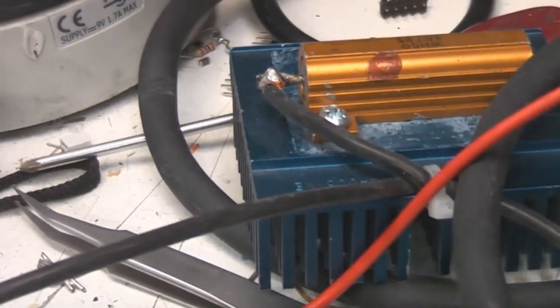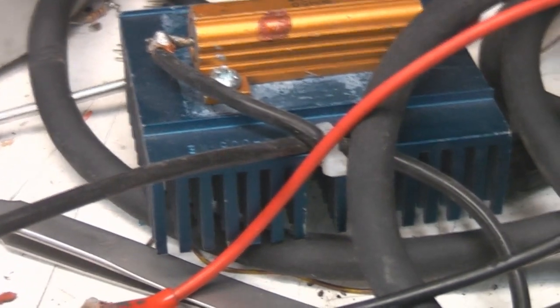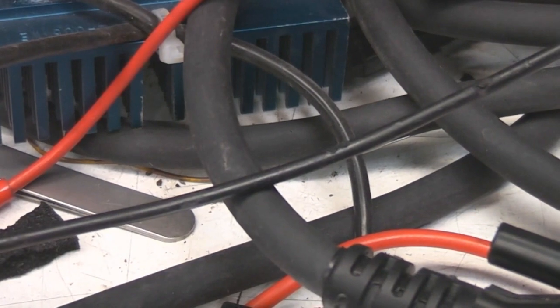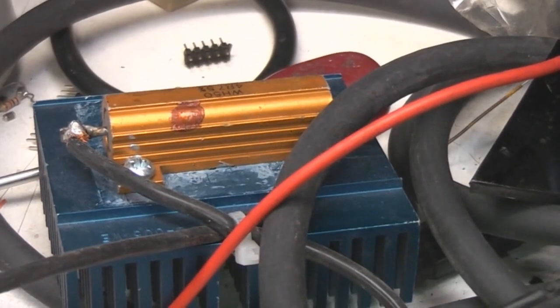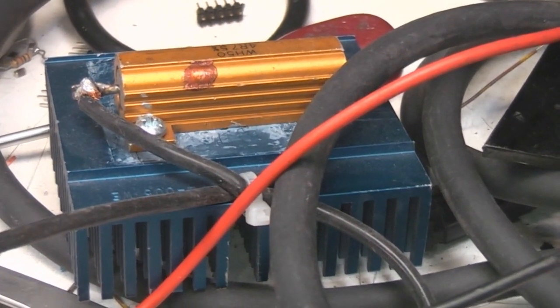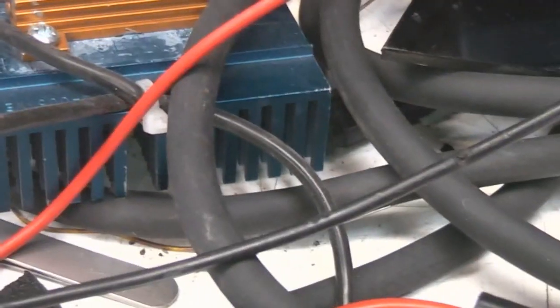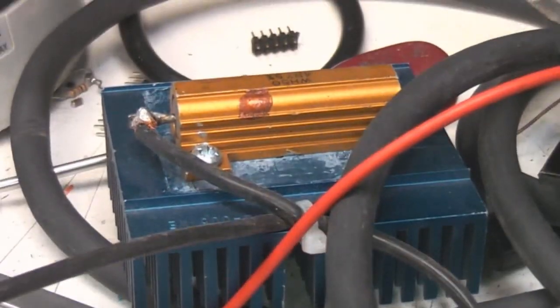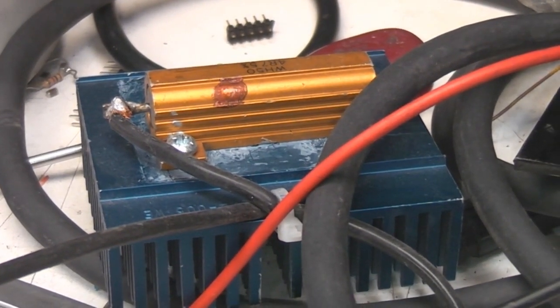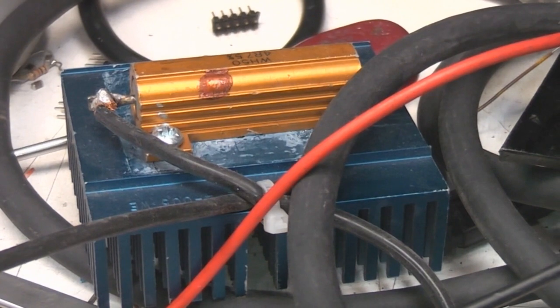What I'm doing to power this, I'm just using a bench supply with a series resistor, because it's very dangerous to use the constant current mode on power supplies. For example, if you set the power supply up to a certain current and then connect it to the load, you're always going to get a big current spike, because the power supply is putting out its maximum voltage until it sees a load. So if you set your power supply to say 500 milliamps and connect it straight across, you're almost certainly going to pop the diode. The nice thing about using a series resistor is it puts a fundamental limit on the amount of current that can flow, and I'm just starting up from zero and very slowly easing it up until we see what the current is.